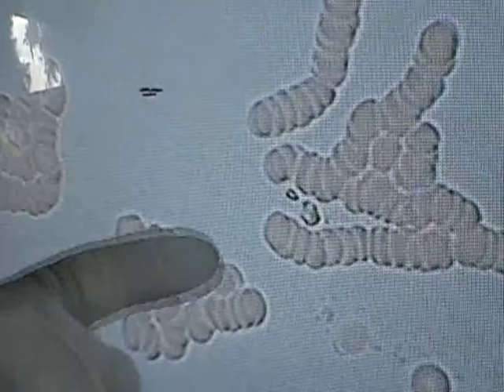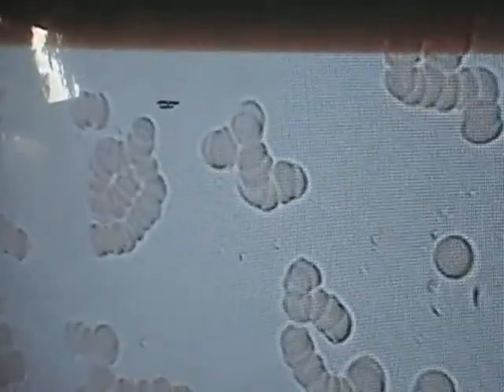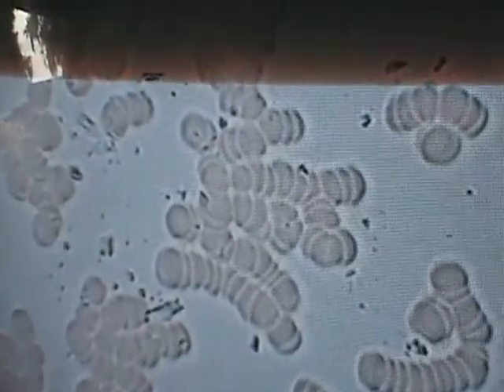Got a little liver stress going on here. Wow, isn't this interesting? Look at the crystals, man. We got a lot of it.